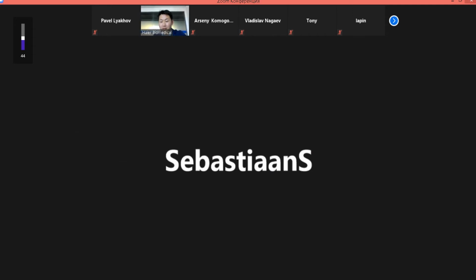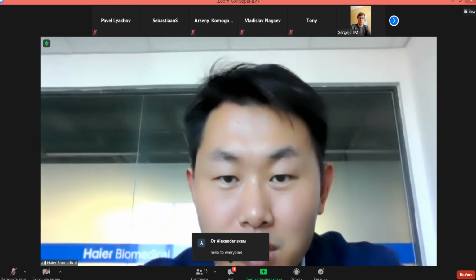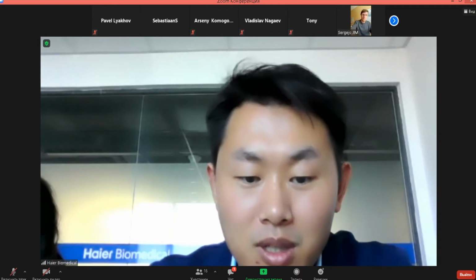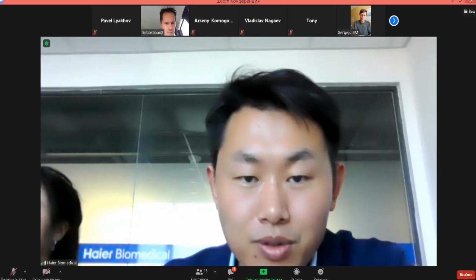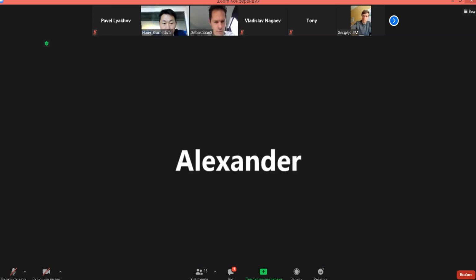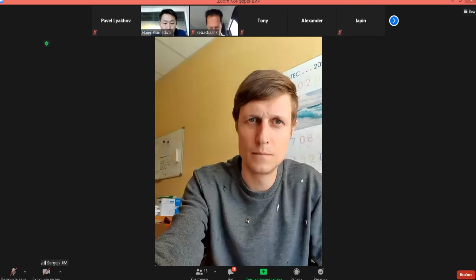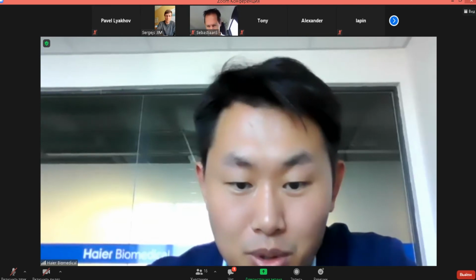Yep, it's very nice. And so today we will mainly do the training for three kinds of products, and they each have a lot of product portfolios. The first one we will start with is the CO2 incubator, the carbon dioxide incubator. The second product will be the steam high pressure steam sterilizer. And the third one will be the liquid nitrogen tank.